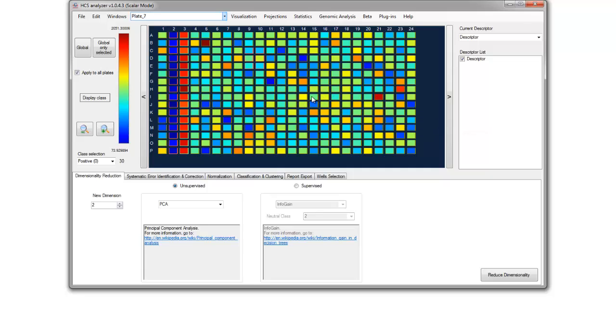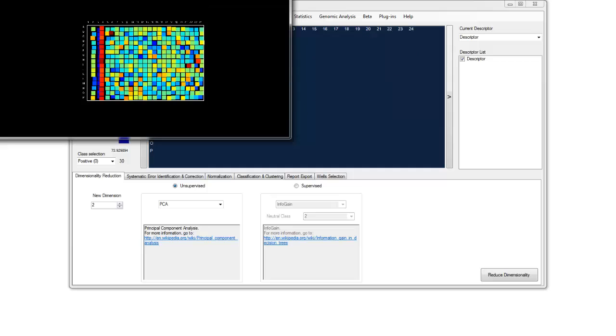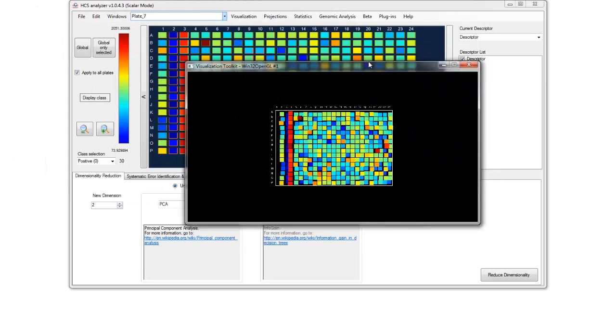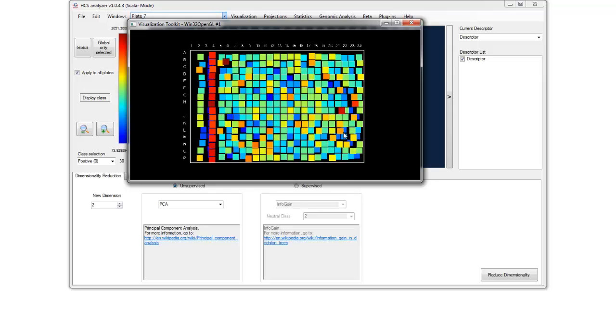So finally, in terms of user interface, and before moving to the more detailed description of the descriptor, you can also right click and turn on the 3D visualization. At this stage, another window appears, and you can use your mouse to play with the 3D view.